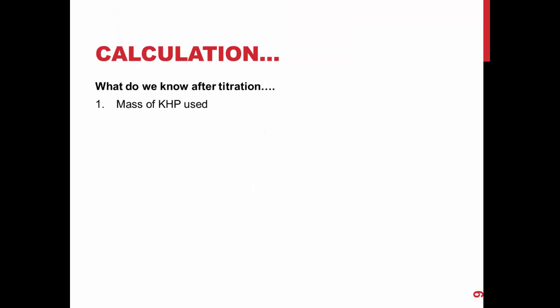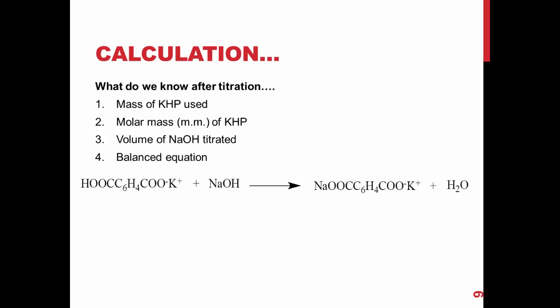Since you know the mass of the KHP used, the molar mass of KHP, the volume of sodium hydroxide titrated, and the balanced equation, you can determine the concentration of the sodium hydroxide as your secondary standard.